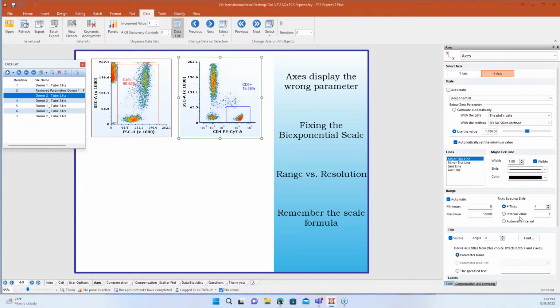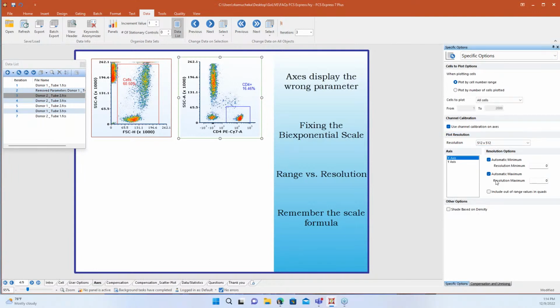If you see that, what's happening is whenever we bring data into a plot to display it, we do what's called binning. So we have little bins where all the events go, and we create little sections so we know how to display them on a plot. Now, range can be great if you're not seeing that feature, but if I'm going to adjust the region that I'm interested in, I always recommend using resolution here. That's under our specific options, or you can right click and use a magnify resolution option, and you can do that with your axes as well. I like resolution because it does two things. It allows me to look at a specific range of data, and then it rebins that data within that range to give it a really nice presentation.